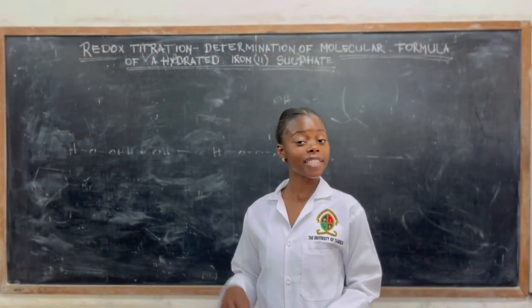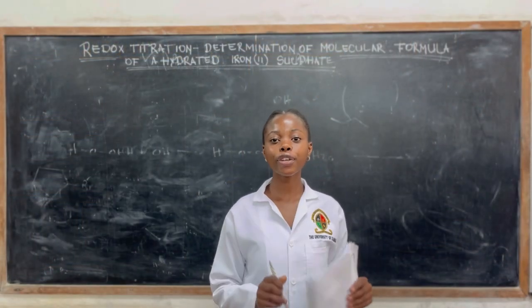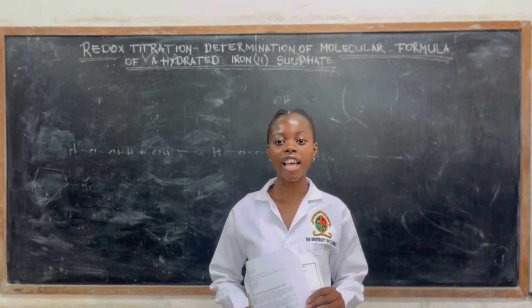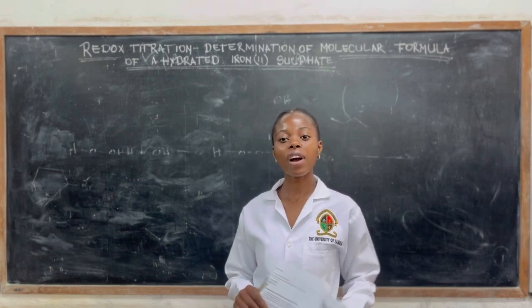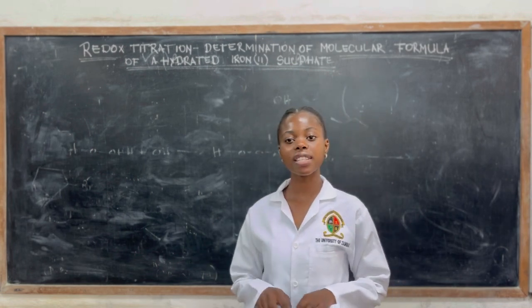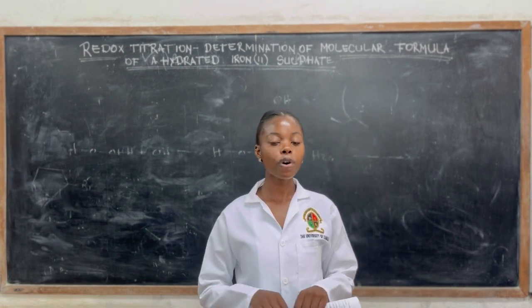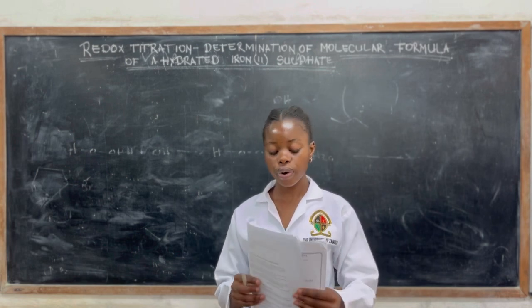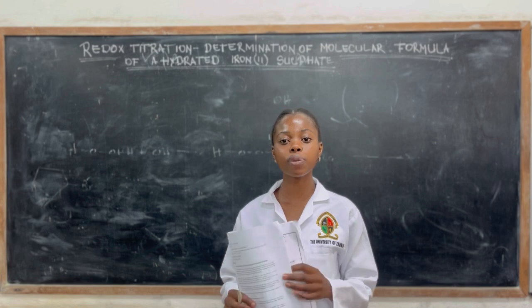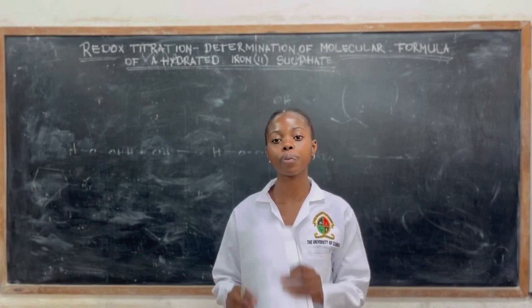Welcome to today's lab session, where we'll be determining the molecular formula of a hydrated iron(II) sulphate solution. In this experiment, we'll focus on how to determine its molecular formula by using a standard solution. It is also important that you go through the data analysis section, which we'll use to determine its molecular formula by determining its empirical formula mass.